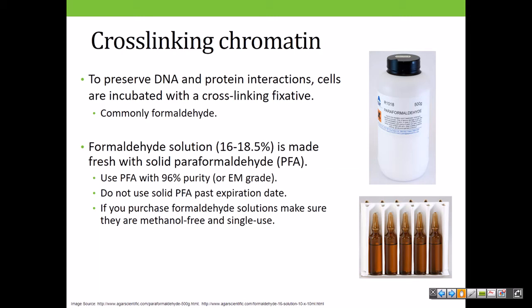If you don't want to make formaldehyde fresh, then you can purchase it. I have some pictures of some ampules you can buy. The issue, though, is that they need to be single use. Again, once you use them, you lose them. And then, of course, they need to be methanol-free. There are a lot of formaldehydes on the market that contain methanol. They either add it as a preservative or it's a common contaminant. Do not want methanol in your formaldehyde.